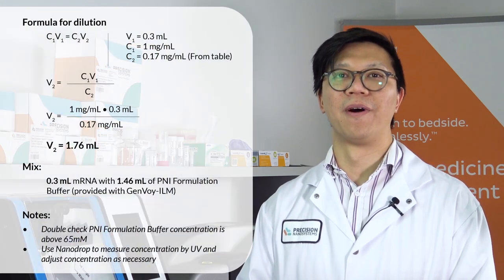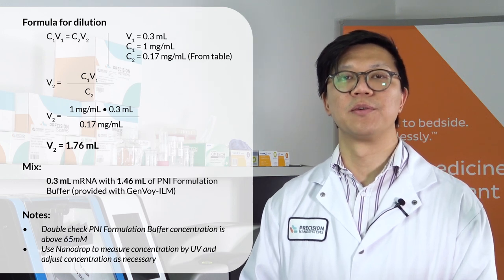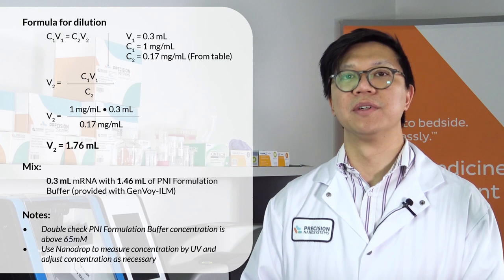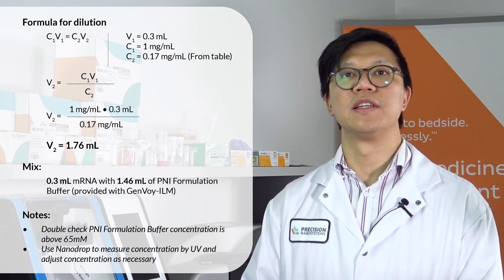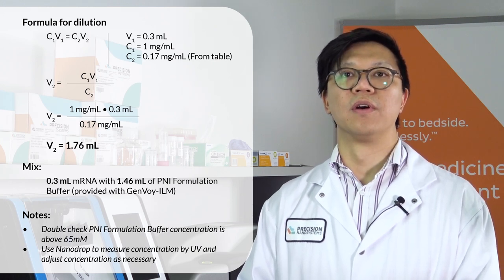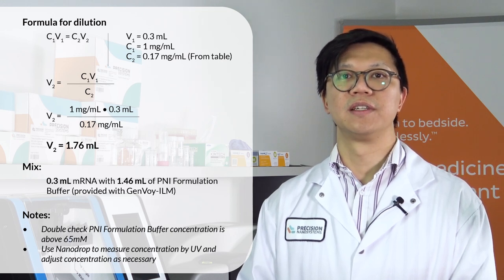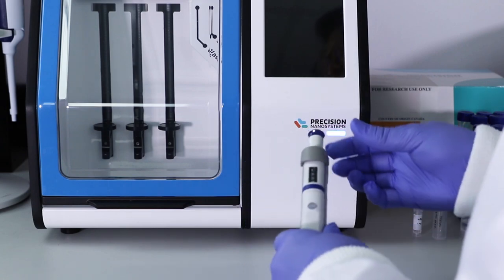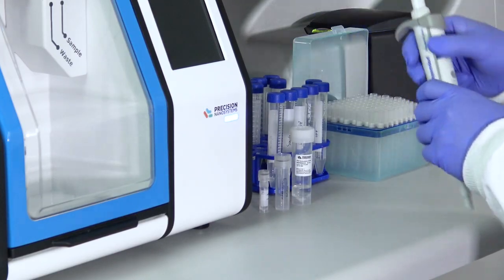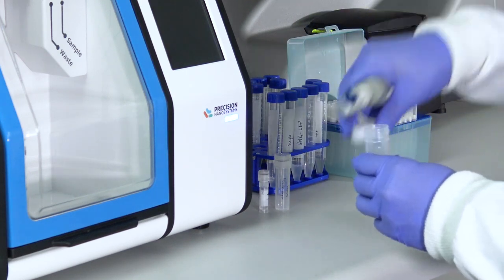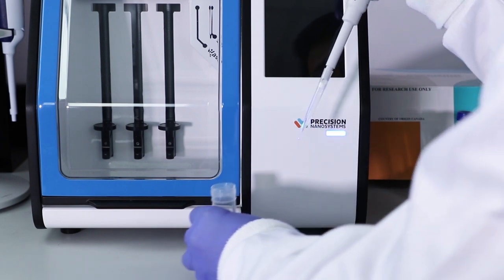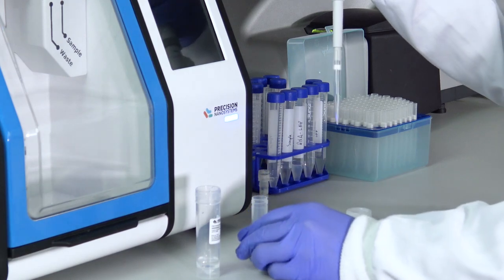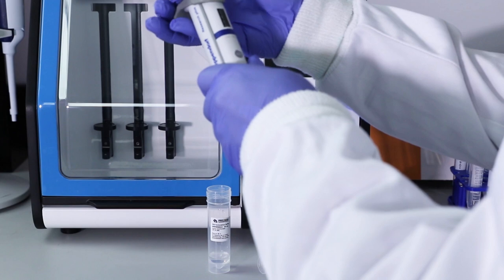Next, we'll be calculating the dilution of your mRNA in the formulation buffer. We're going to encapsulate 0.3 mg of mRNA and calculated that will be 0.3 milliliters. Our final concentration from the table needs to be 0.17 mg per mL. Using this dilution formula and rearranging for V₂, you'll see that we'll need a final volume of 1.76 mL. That means we'll be mixing 0.3 mL of mRNA with 1.46 mL of PNI formulation buffer. We'll start by pipetting the PNI formulation buffer first.